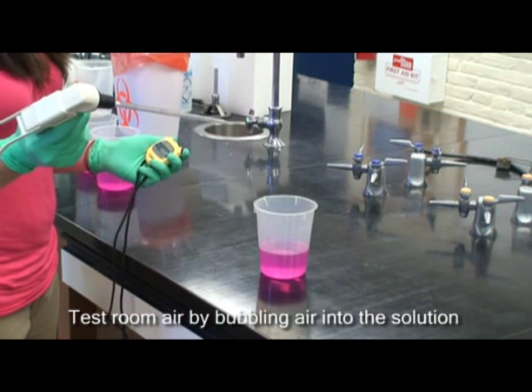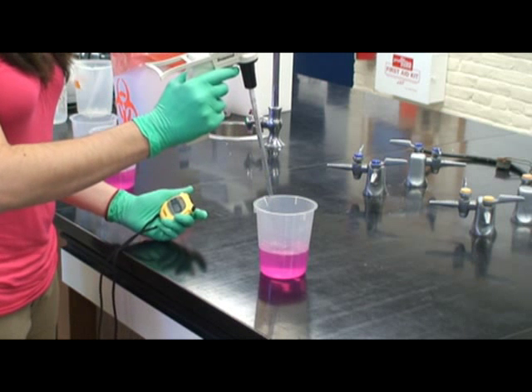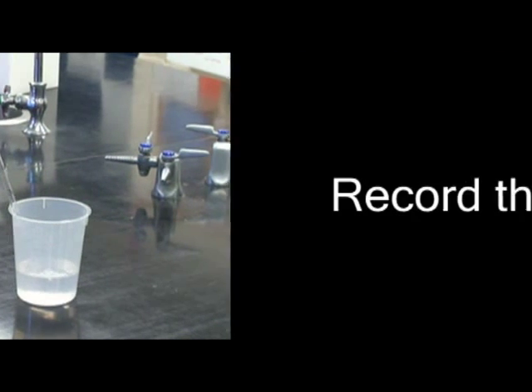Test the room air by bubbling air into the solution. Measure the time it takes to turn from pink to clear. Record the time.